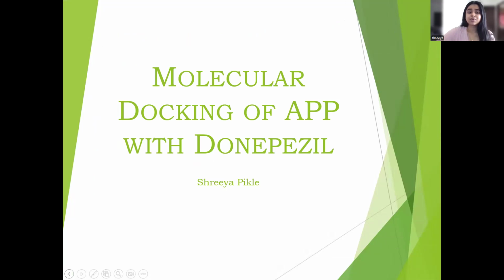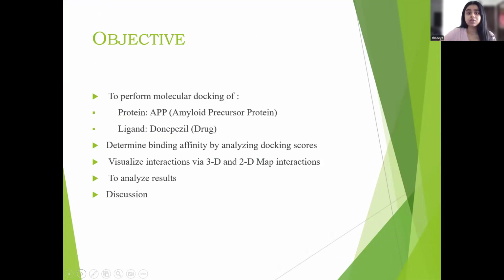So my topic was to perform the molecular docking of APP with Donepezil. The key objectives of this presentation and this experiment were to perform the molecular docking of the protein assigned, which was APP, amyloid precursor protein, and with the ligand of choice. I chose Donepezil, which is a clinically proven drug for the treatment of this disease.